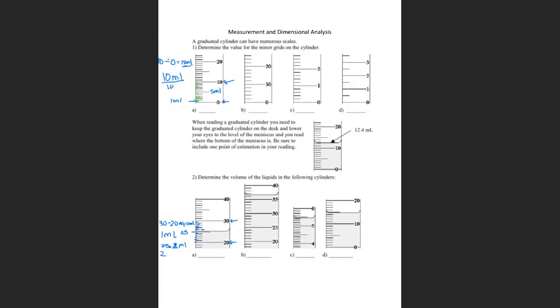That's the 2, 5. It is certain because it's actually on a mark. And the one that I had to estimate is the 0.3 part. This part is the estimated part. Of course, the measurement here is milliliters. I think one of your homework questions should have a question like this, where they're asking you either how many decimal places or how many significant figures. If they ask how many significant figures can you correctly read in this volume here, you would say 3.